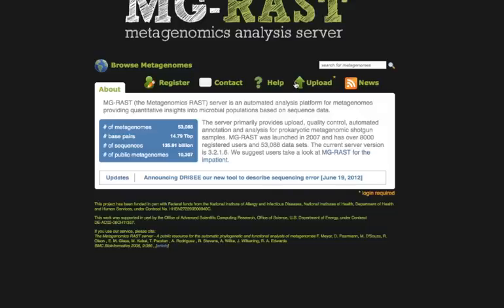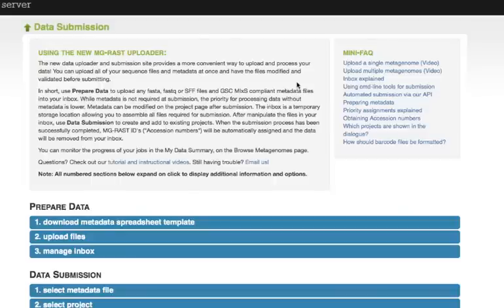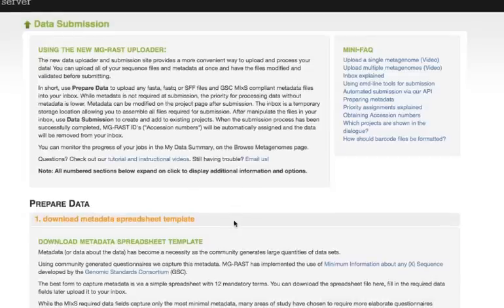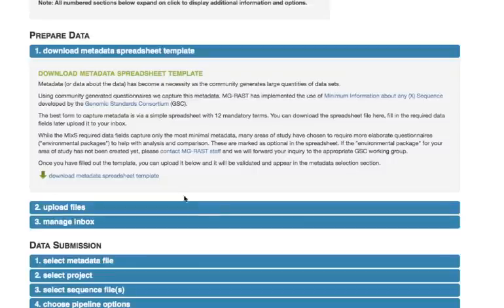The purpose of this video is to help you submit metadata with a new MG-RAST job submission, using the metadata template file provided on the upload page. The template can also be used to update metadata of existing completed jobs, although that is not discussed in this video.